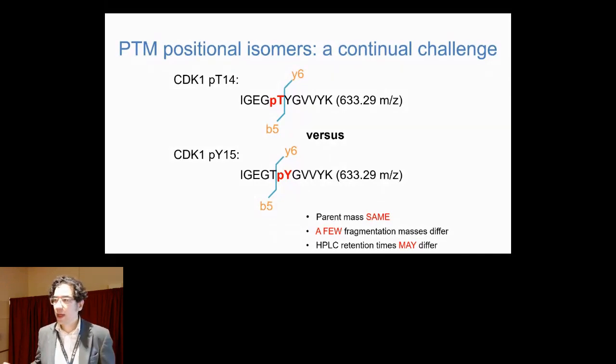So this becomes a continual challenge for trying to analyze phosphorylated samples, and in this particular case phosphorylated samples, but all types of PTMs using DIA-based methods, but also DDA-based methods, because they have very similar characteristics chemically and structurally. And so this is continually challenging, because both of these sites being phosphorylated at either one of these essentially has the same sort of function downstream, but it definitely indicates different biology for who phosphorylated whom in this circumstance.